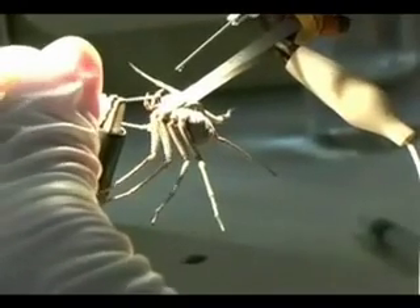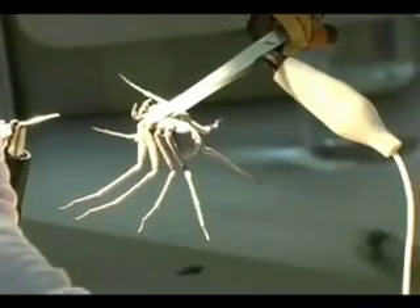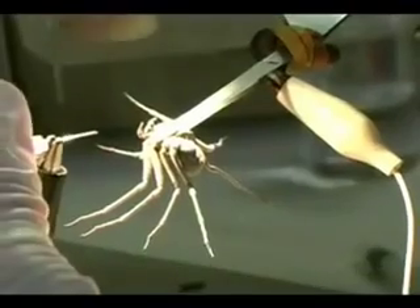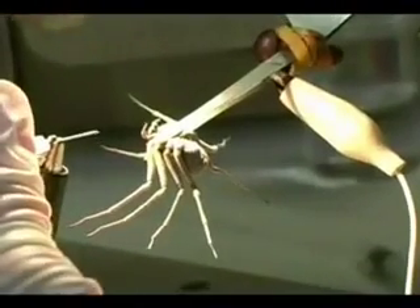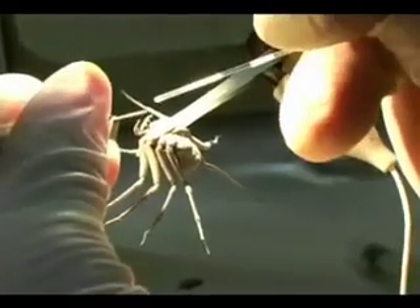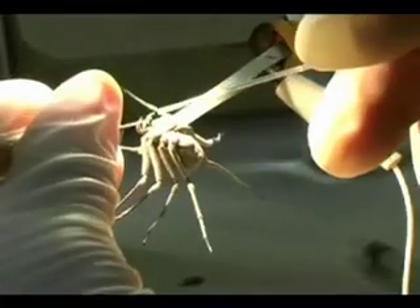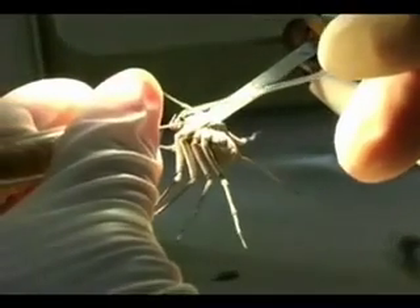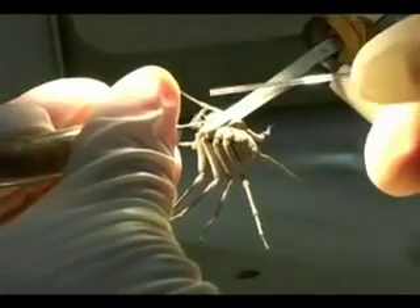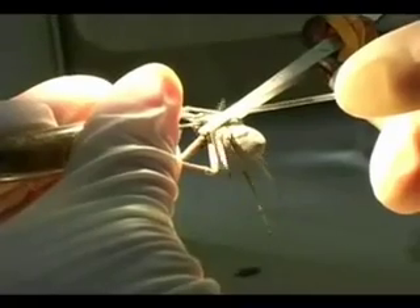There's still a lot of sand on the spider, but that's okay. Now I have a glass capillary in my right hand that I'm going to place right next to the fangs, and I'm going to step on a foot pedal that will deliver 12 volts of electricity through the spider.